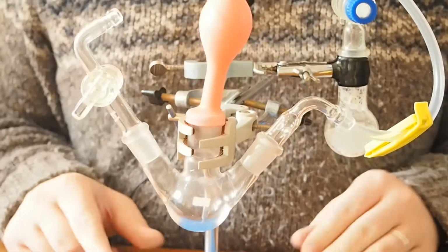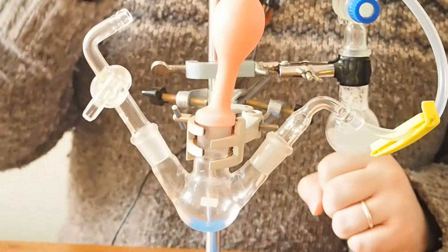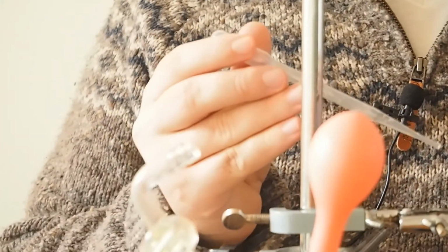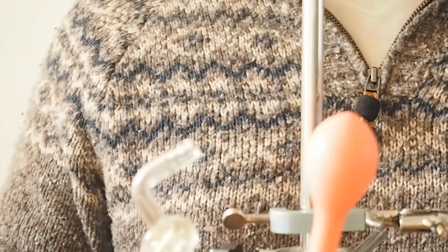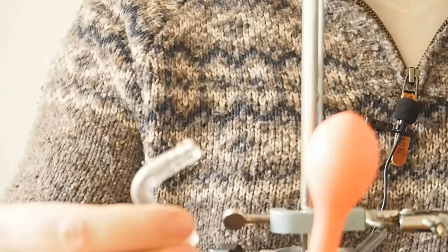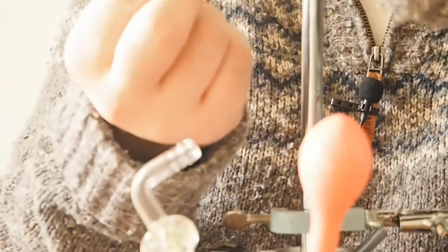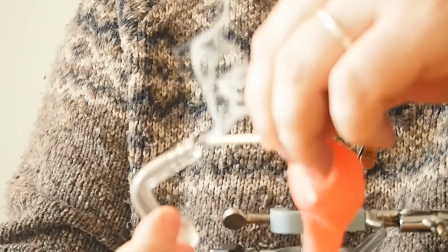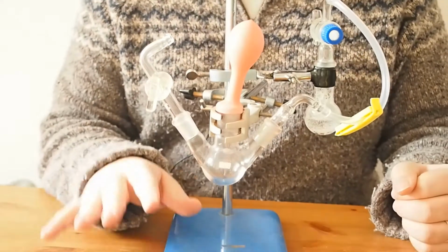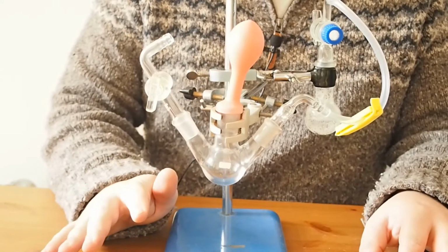Now, is there a way that we can test that we've got carbon dioxide present in this system? Well, yes, there is, and let's have a look at that. So what I'm going to do is take a lit match and hold it in front of this little valve. Let's just make sure everything's nice and tidy, and we'll see if it extinguishes. There's my lit match. And we'll open up this valve. Did you see? So we know now that this chamber here is completely under a carbon dioxide atmosphere, or at least that there's not enough oxygen in there to keep a flame burning on a match, which is fantastic.